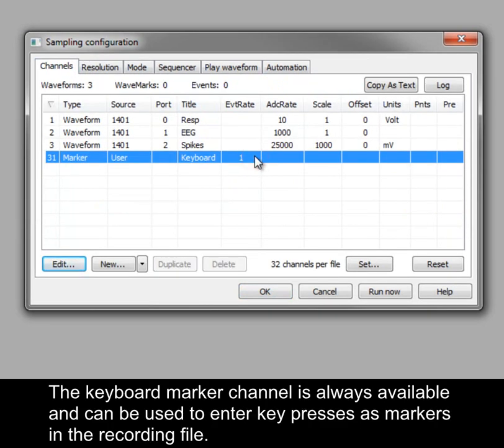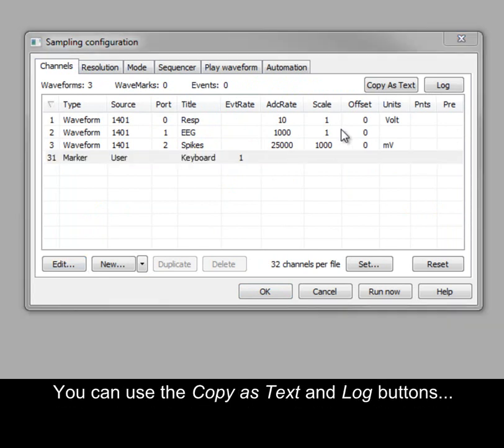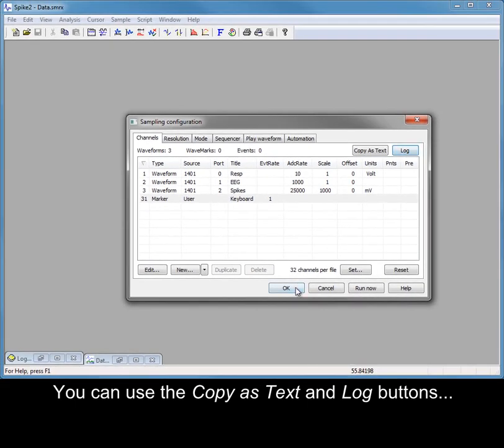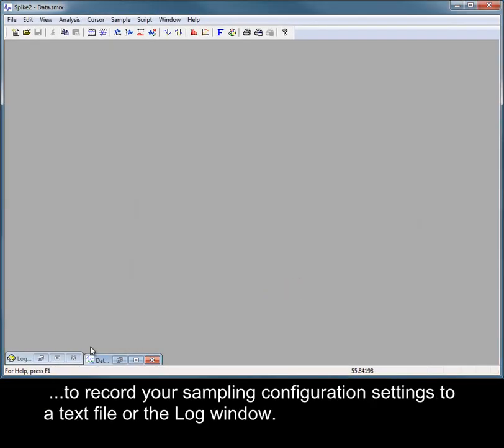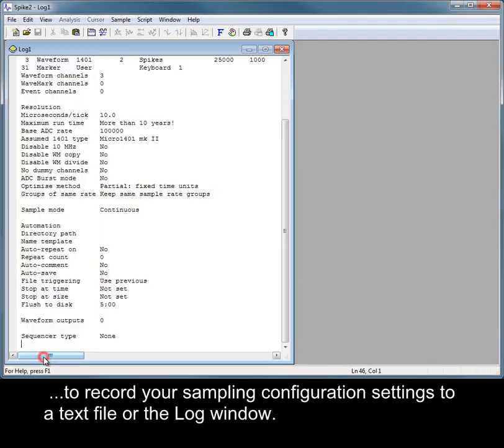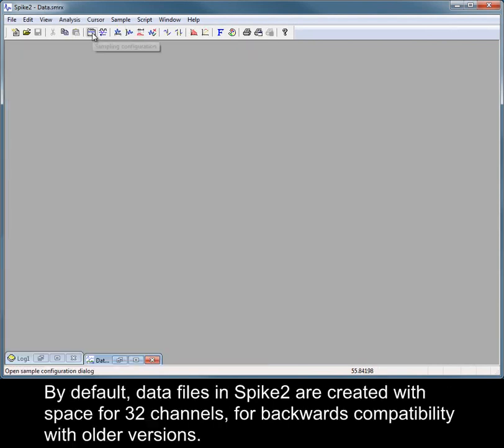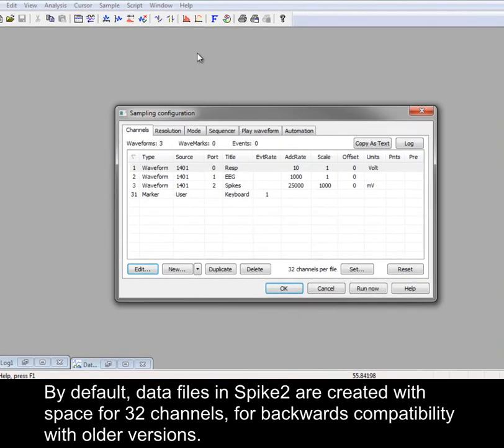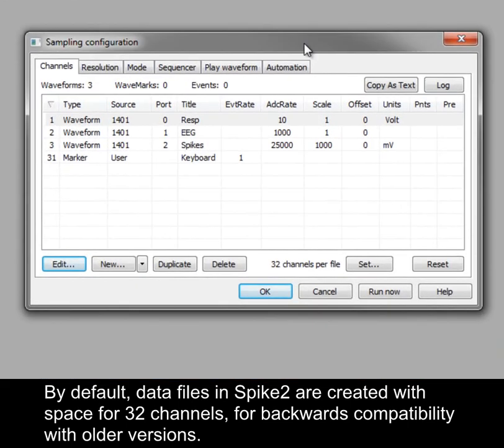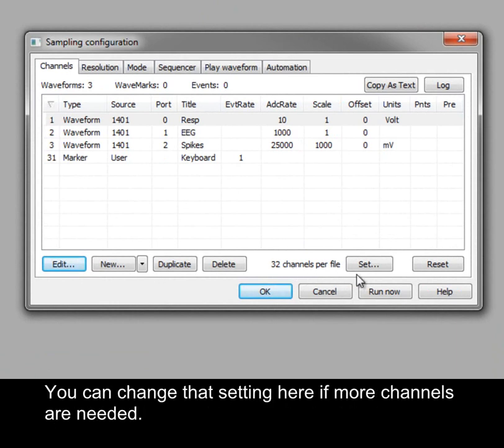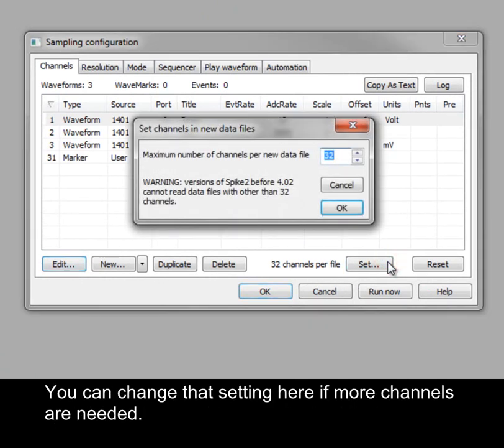The Keyboard Marker channel is always available and can be used to enter key presses as markers in the recording file. You can use the Copy as Text and Log buttons to record your sampling configuration settings to a text file or the log window. By default, data files in Spike2 are created with space for 32 channels, for backwards compatibility with older versions. You can change that setting here if more channels are needed.